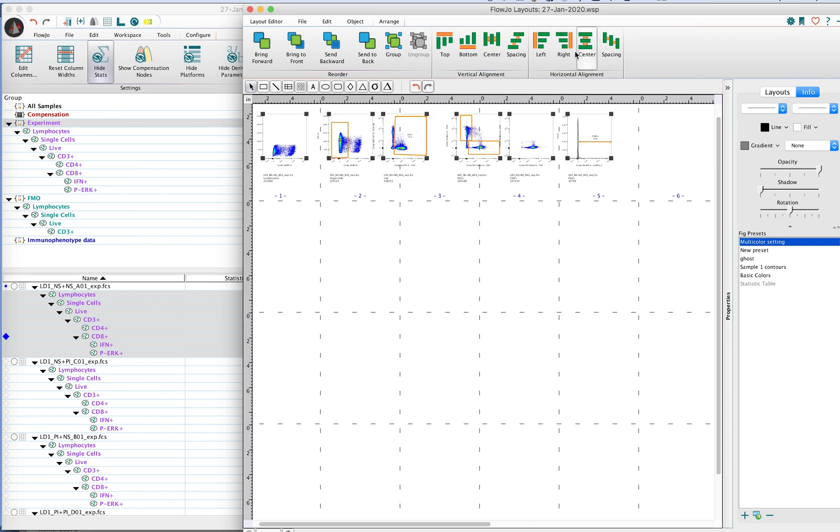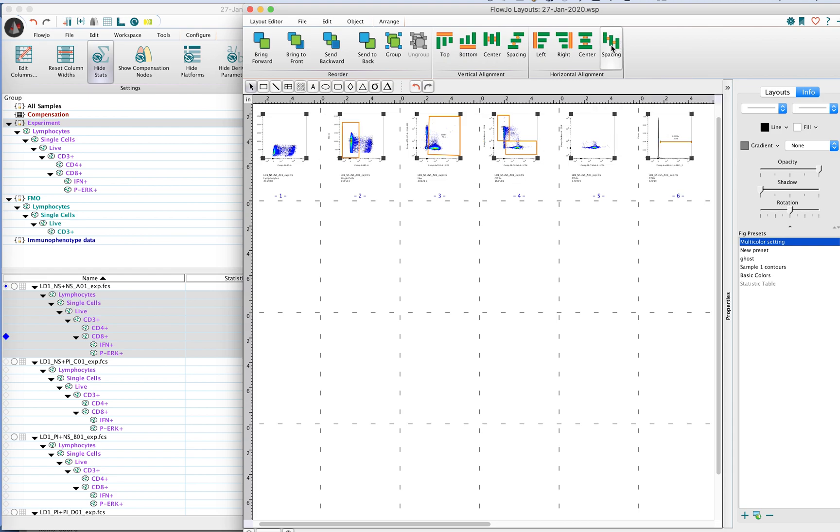You can make this evenly spaced by going to the horizontal alignment button and clicking there, and then you'll get a nice arrangement of your plots such that everything is equally spaced.